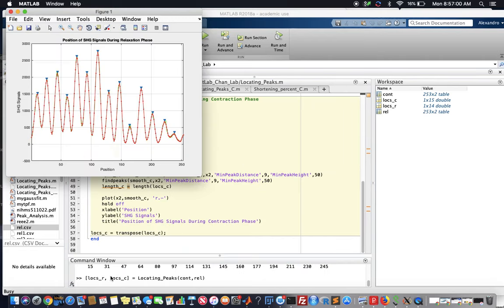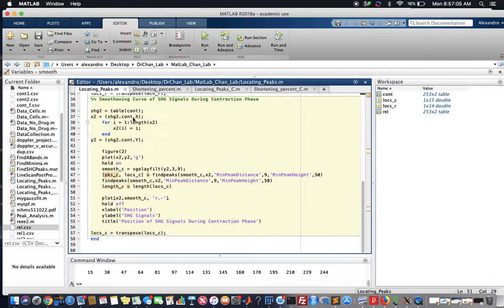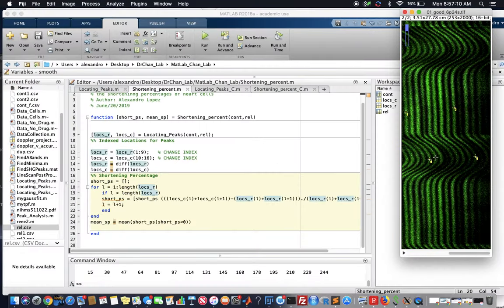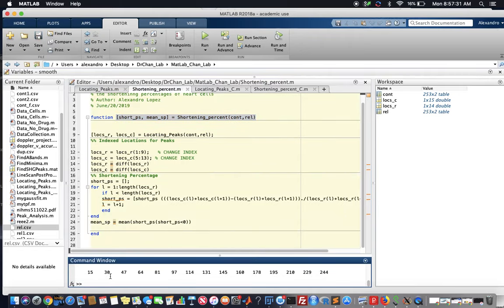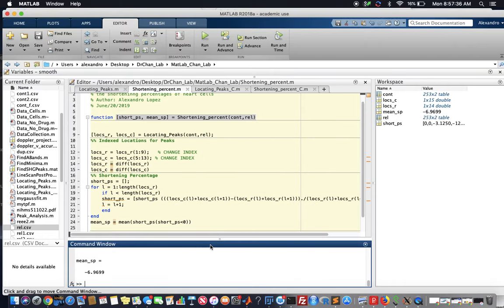All right, now let's go ahead and plot the normal one again. And there you go. So now we're going to be going from 1 through 9, and then 3, 4, 5, 6, 7, 8, 9, 10, 11, 12, 13. So 5 through 13. Now we've got this set out, so you can just copy and paste this at the bottom and go ahead and run it. And you're going to get these results here.